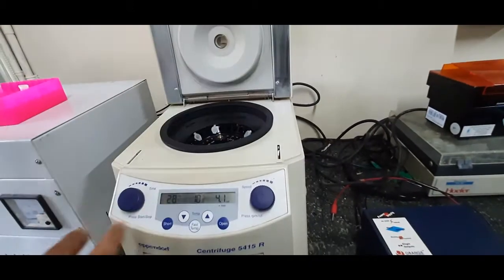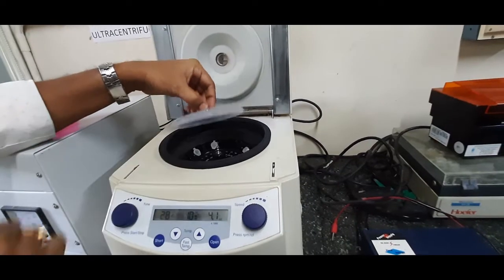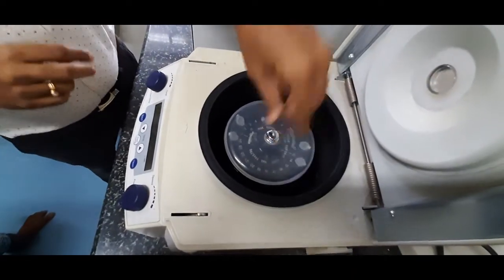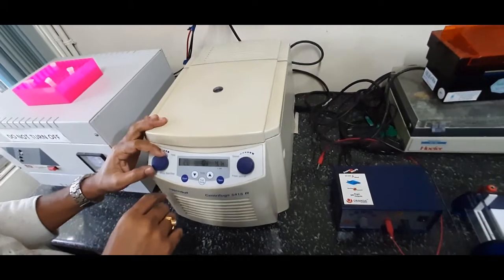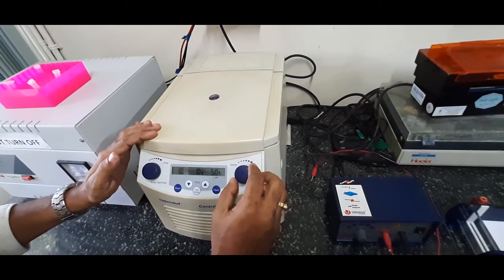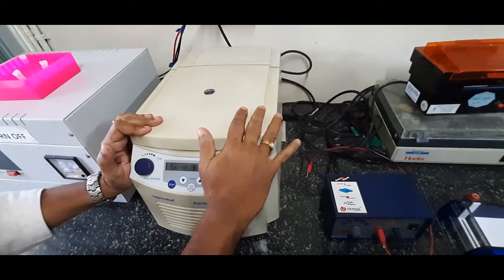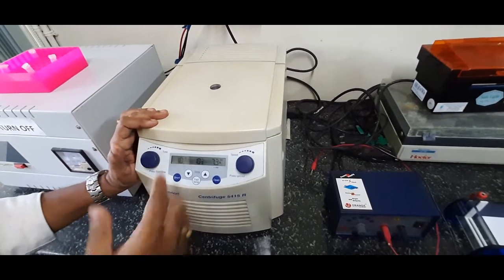The inside will be cooled so that nuclease activity can be minimized. This is the safety cap — after inserting the samples, you have to close it with the safety cap, then close the main lid. Then you set the time and the speed, and press start. After the set time, the machine will automatically stop, and then you can withdraw the sample.